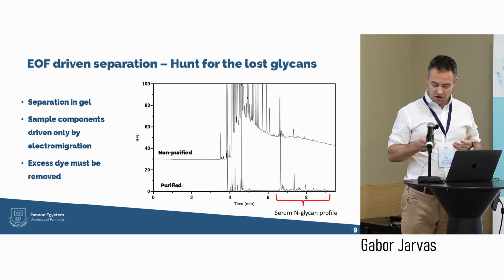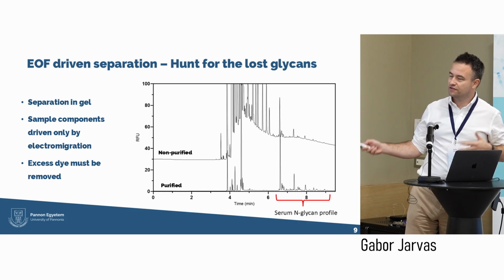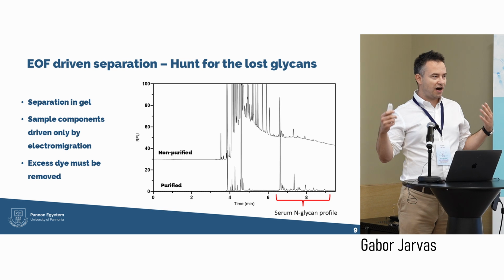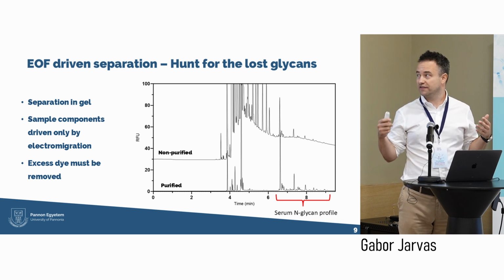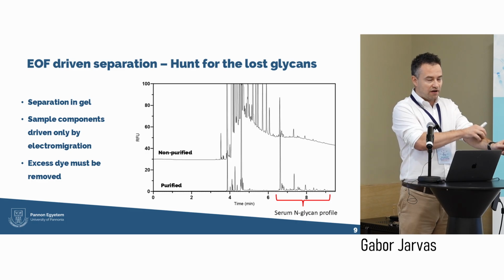But again, if you compare these two, the purified trace against the non-purified, it's so obvious that during the purification, there is a chance, a high risk to lose glycans. And it is not just for CE, it also could be valid for HPLC as well.